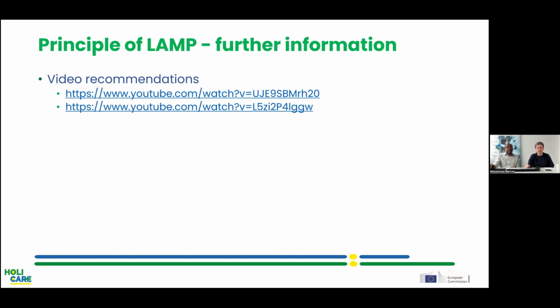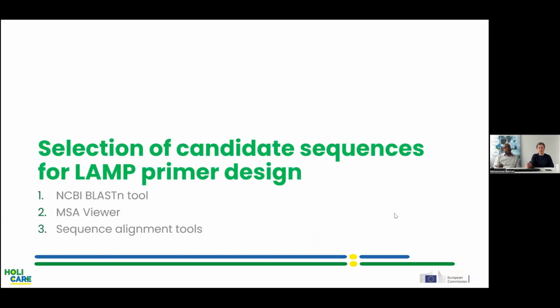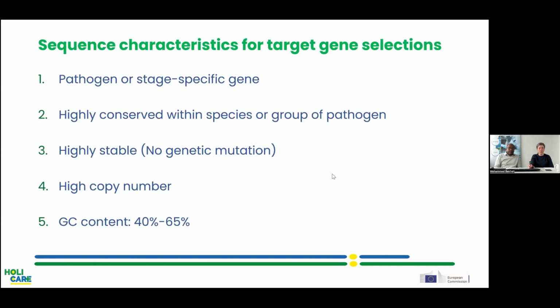Yeah, so in the next about 20 minutes, I will talk to you about how to select suitable candidate sequences for the LAMP primer design. And therefore, I will introduce to you the NCBI BLAST tool and the MSA Viewer and sequence alignment tools. So first, here you can see an overview of characteristics that a suitable sequence for LAMP primer design should meet.